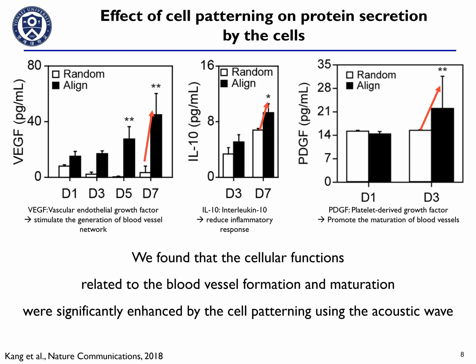From the cellular experiments, we found that the cell patterning using acoustic wave could increase the various cellular functions related to the generation of new vessels and stability of the blood vessels.